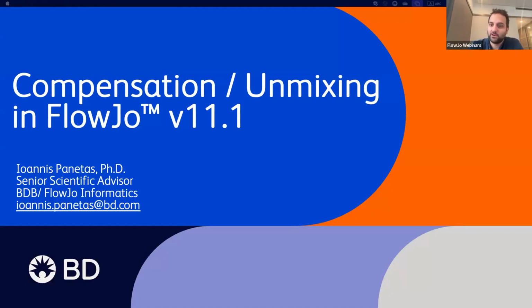And today we're going to be talking about compensation and unmixing. Those are very closely matching terms, right? They're very similar. We're going to be discussing what makes them so different and why we have different terms for the same thing. So I will introduce you to the concept of compensation and unmixing and why it is essential to do it in our data analysis.